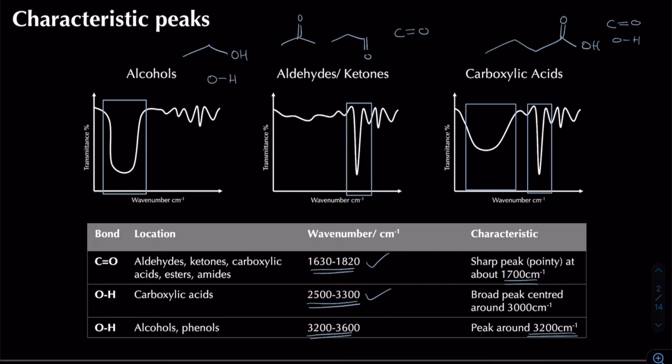And so in that case, if we've got OH, but this time for a carboxylic acid, we've got an OH bond for that as well. So in that case, you should be able to identify these characteristic peaks quite swiftly in the exam and be able to answer longer, structured analytical chemistry questions with this as well.